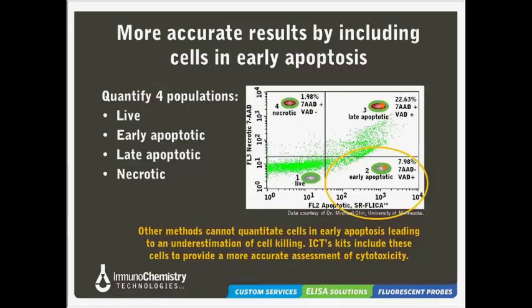Oh, okay. Well, looking at our data here from the total kit, we actually considered that, but annexin V can be rather nonspecific. There are certain features of its binding with phosphatidylserine which tend to lead to some false positives. The phosphatidylserine molecules are inverted within the lipid bilayer of cells for some reasons other than apoptosis. You may see many non-apoptotic cells become positive for annexin V, even though they're actually not apoptotic. It's just a normal feature of some cell membranes, and caspases are really an early and direct indicator of apoptosis, while phosphatidylserine is a side effect and often appears late in apoptosis. Caspases are a much better indicator of apoptosis, and this is a case where you'd really want to consider what's the artifact that you're measuring.